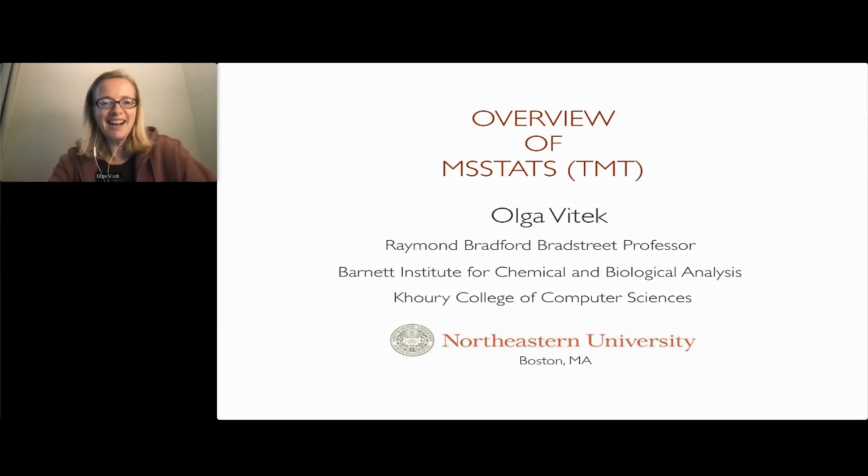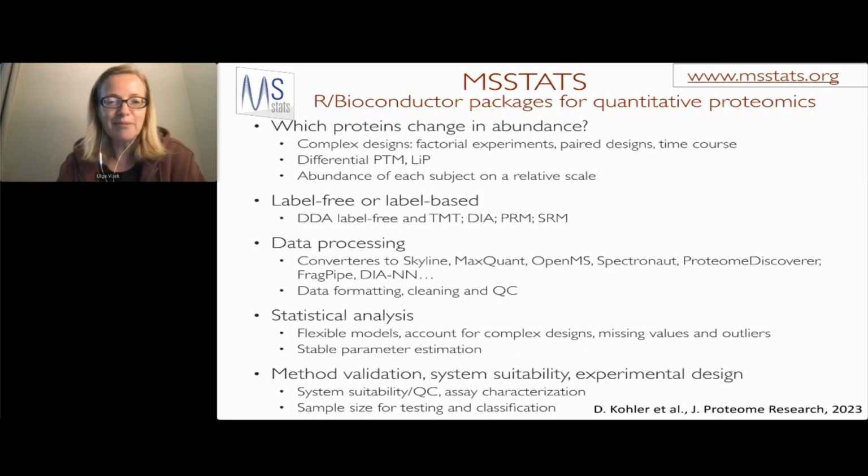My name is Olga Vitek. I'm a faculty in the Khoury College of Computer Sciences at Northeastern University. I am a statistician by training. My group is interested in all things quantitative mass spectrometry and proteomics. In particular, we are developers and maintainers of MS-Stats and MS-Stats TMT, which is open source software for design and analysis of quantitative mass spectrometry-based proteomic experiments. Today I am very excited to share with you what we do specifically in the MS-Stats and MS-Stats TMT space. And the hope is that it will be useful for many of you.